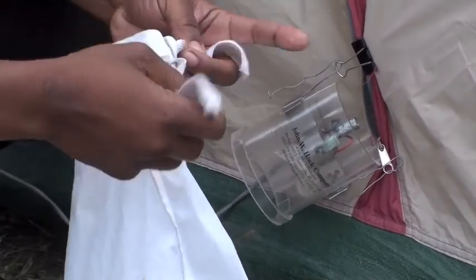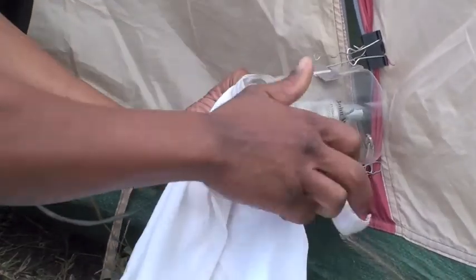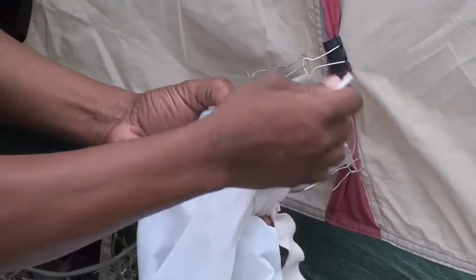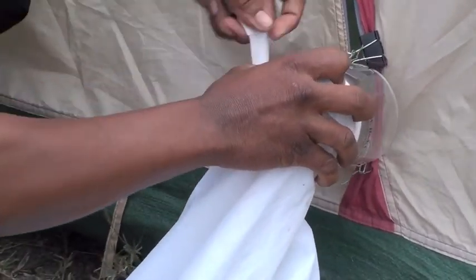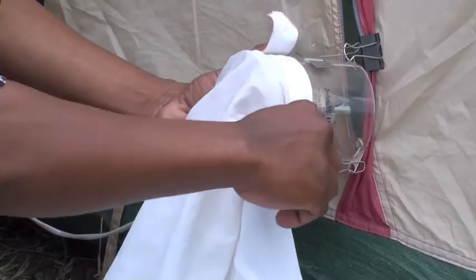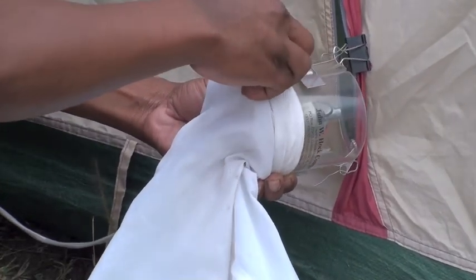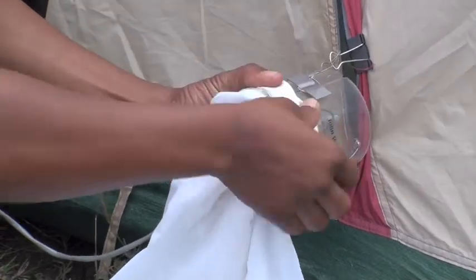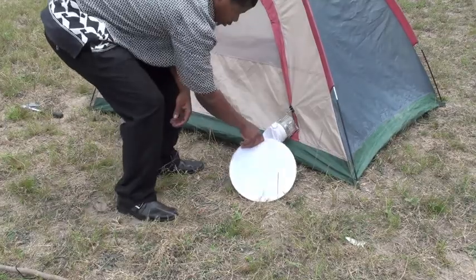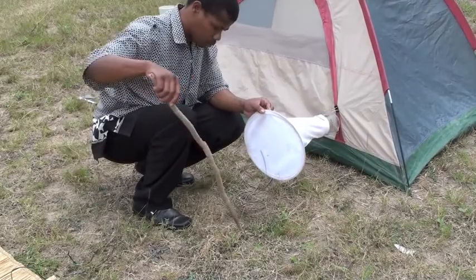The next thing to go on is the collection bag. The collection bag is held horizontally away from the wall.